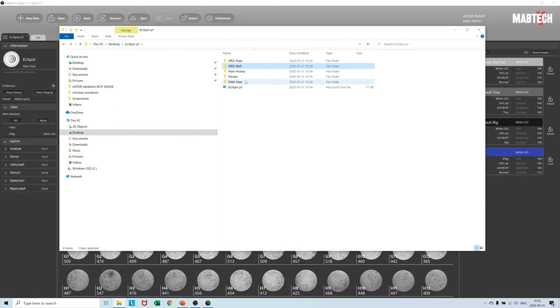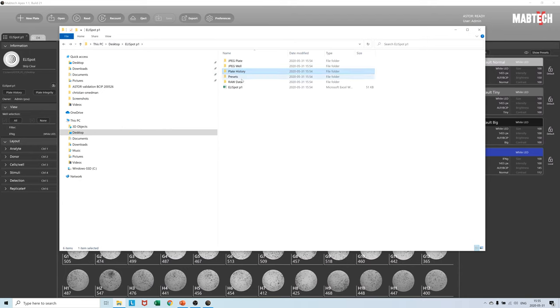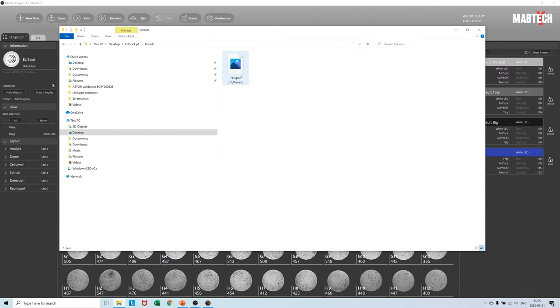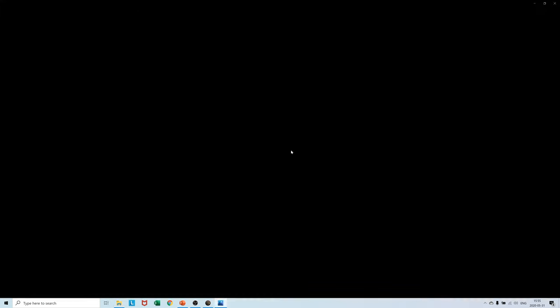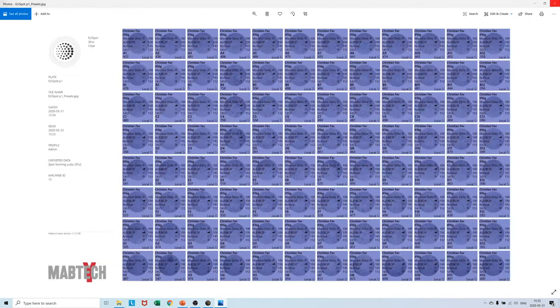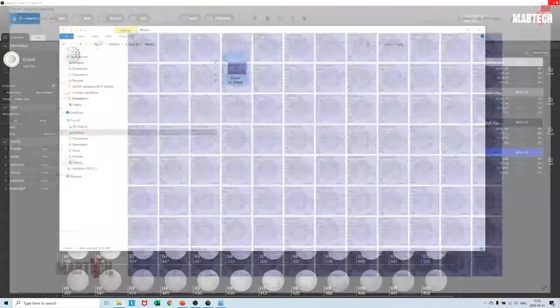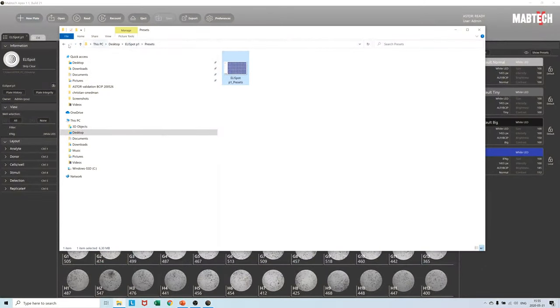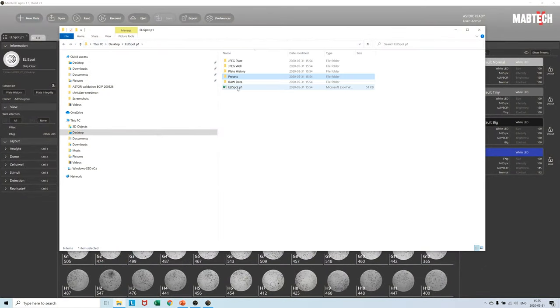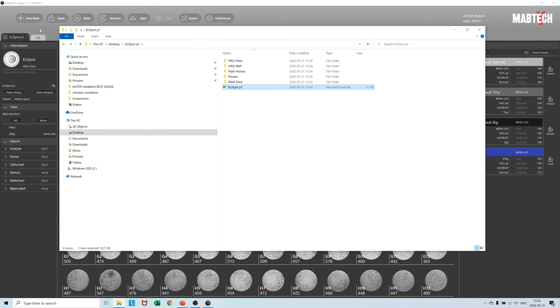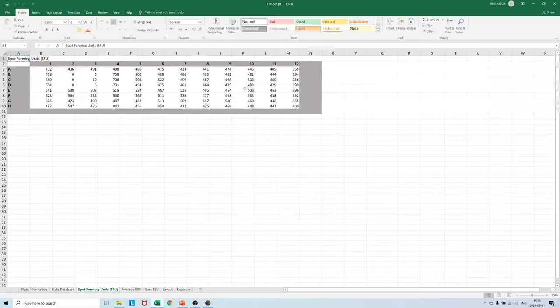Plate history records all changes ever made to the plate and its integrity is controlled by our built-in checksum system. The preset folder is a graphical overlay of which settings were used when the plate was saved. Raw data contains our image raw files. The Excel file is always automatically generated upon saving of the plate.